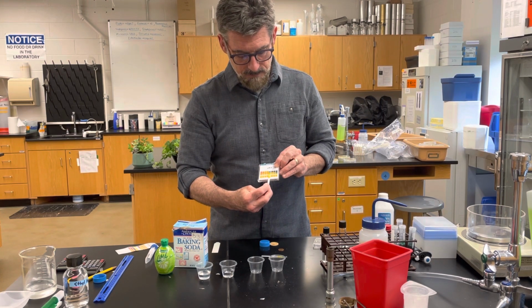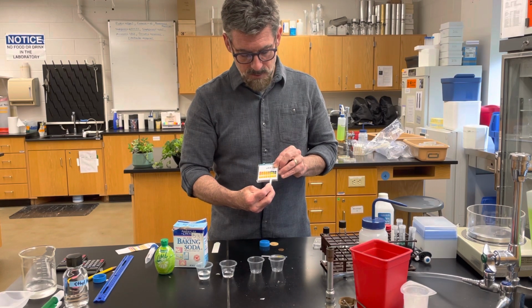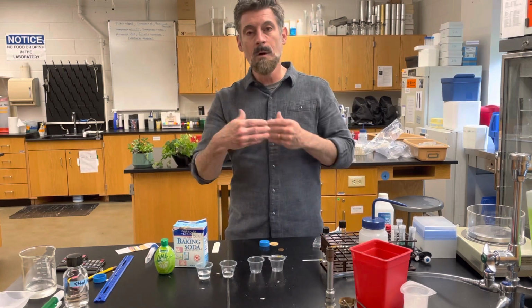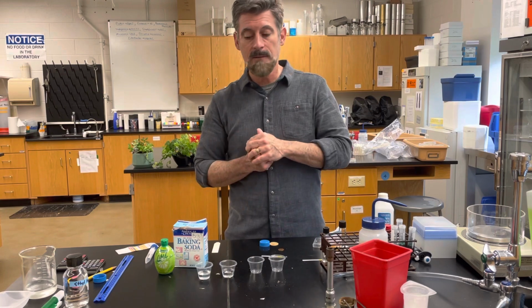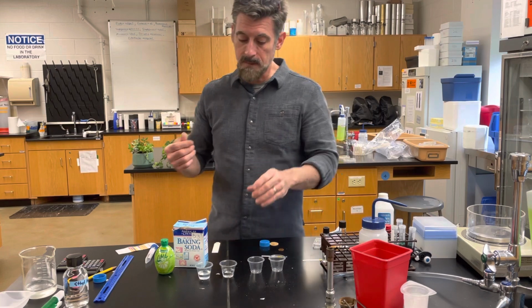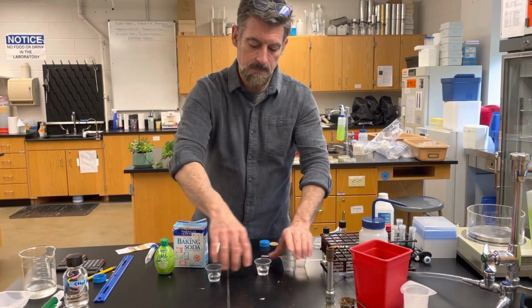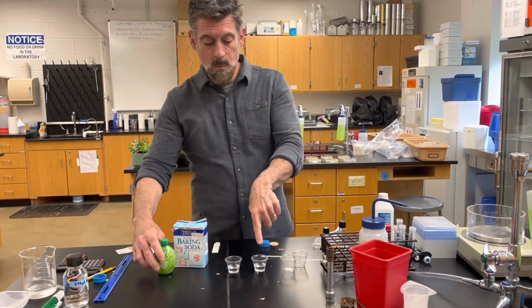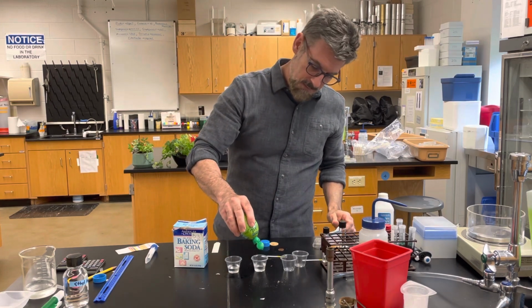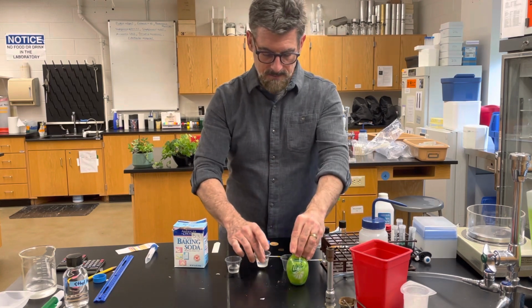So here we go. This is again the deionized water we have here in the lab. Same thing, looks pretty similar. So I'm going to use either one of these as the starting solution. And what I'm going to want you to do is then adjust the pH of a solution using something that's fairly common and safe that we could use at home. So I had these 2 solutions. They both were roughly pH 7. Right? So I'm going to just use these 2 cups then. And into one of these cups, I'm going to put just some lime juice. And I'll just put 6, 7, 8, 9, 10 drops of lime juice into that and mix it up.